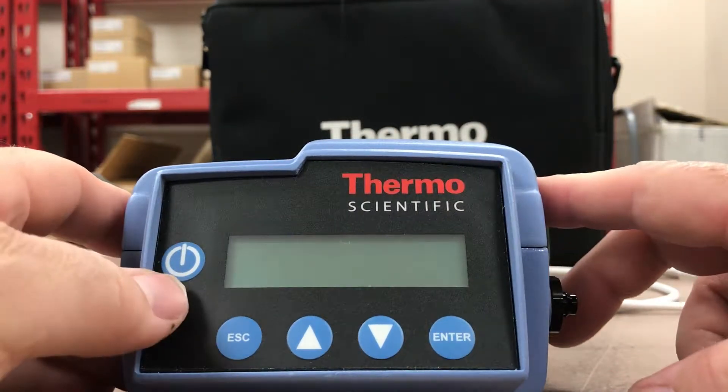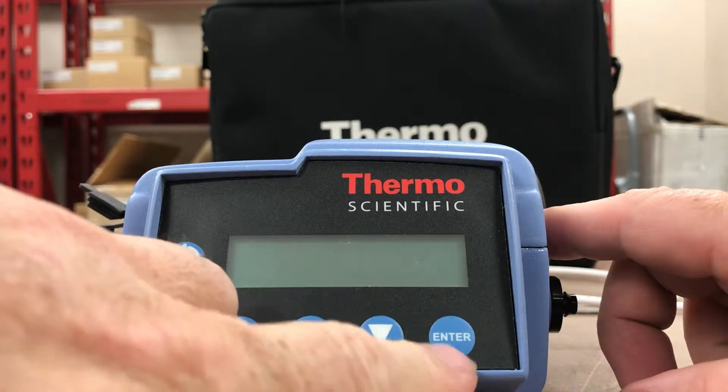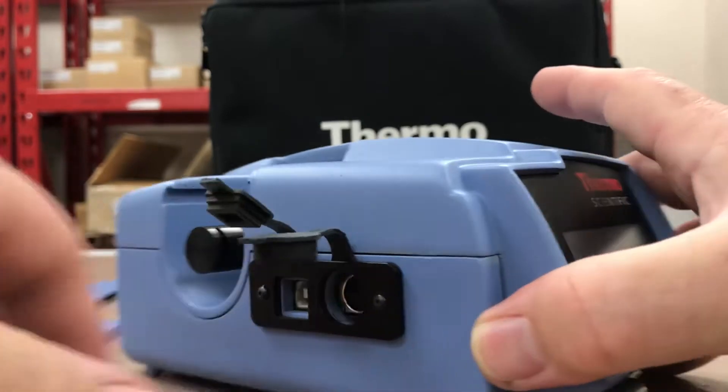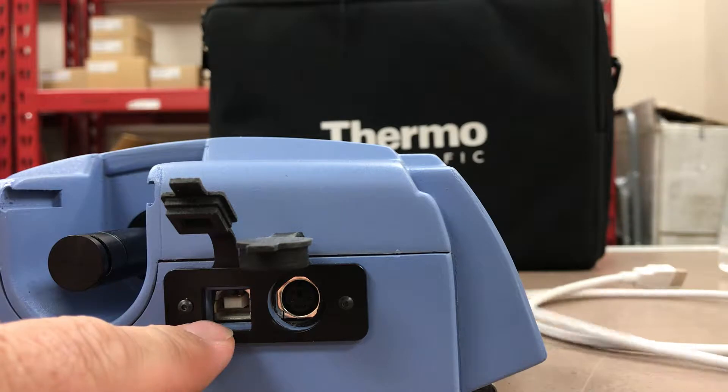you can see the power button and a few function keys: Escape, Up, Down arrows, and the Enter button here as well. Looking at the side of this unit, we have a USB port because there is a USB cable that we can attach to it.